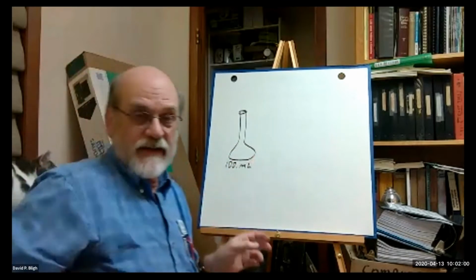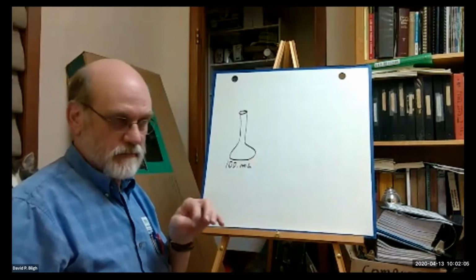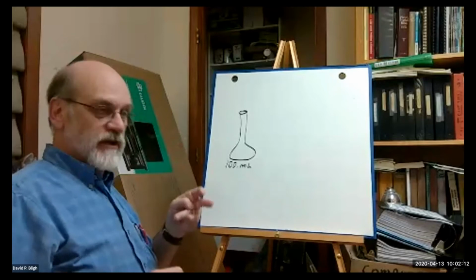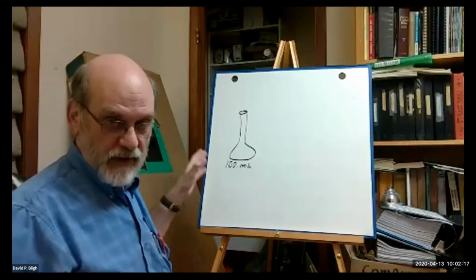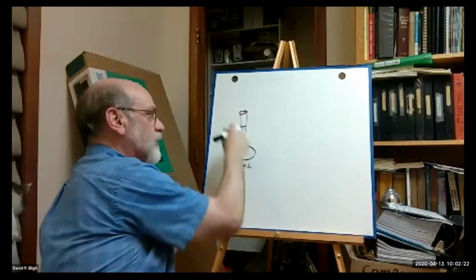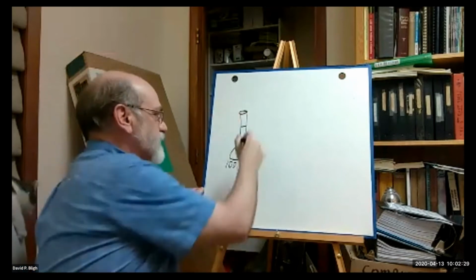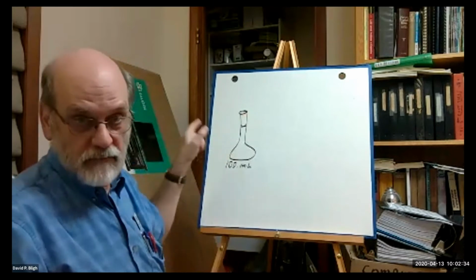A volumetric flask is calibrated so that you know exactly, within certain experimental error and with error that's defined by the glassware itself, that you would have 100 milliliters in that flask. And there's a mark on it right here somewhere on that neck. And all you have to do is be sure that your final volume has the meniscus sitting on the bottom, right on that mark.